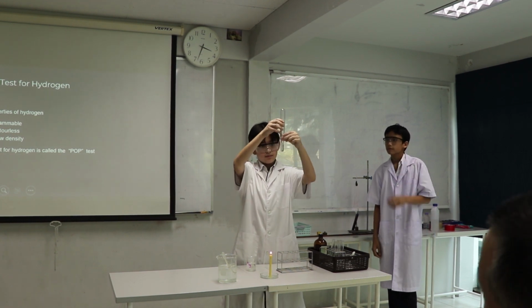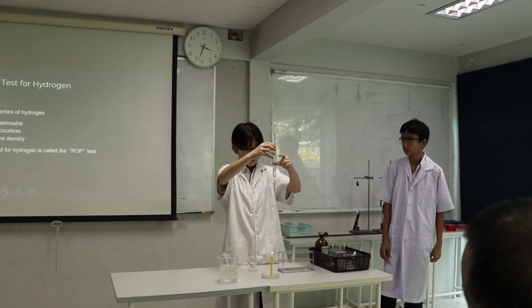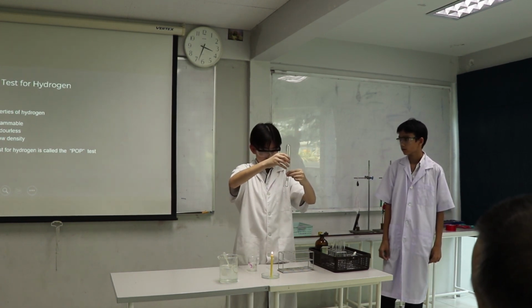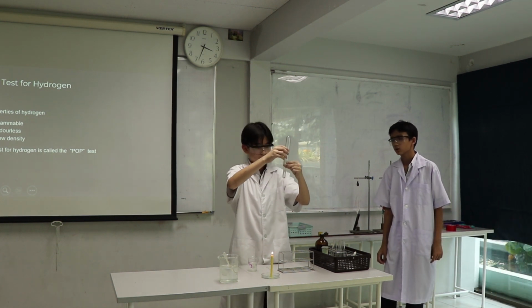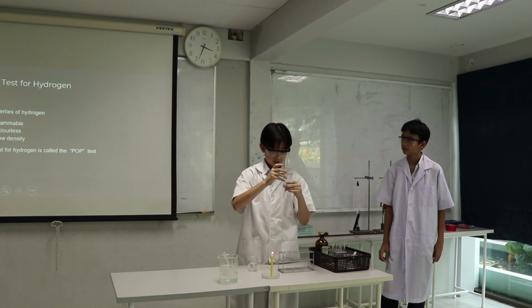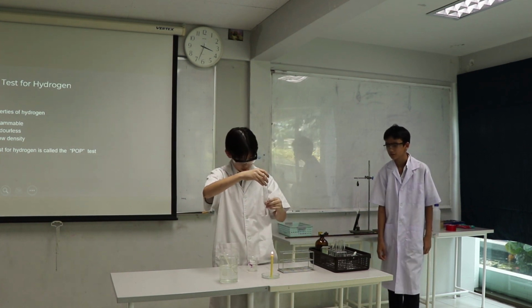As you can see, it is bubbling and is making a fizzing noise. The bubbles are producing hydrogen. It will be trapping the hydrogen and putting it on the flame, and it will create a popping noise.